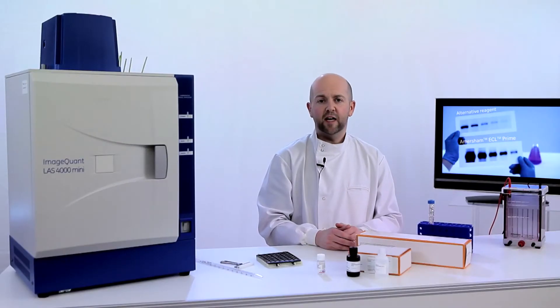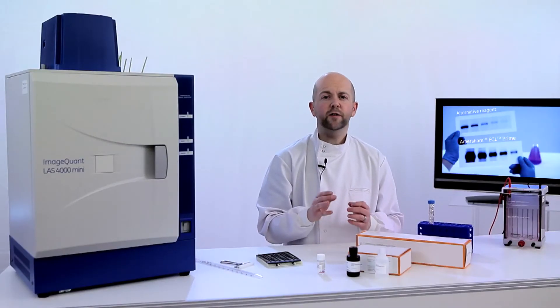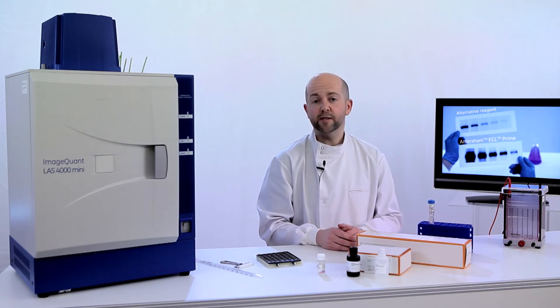There are three areas for you to consider before you start. It is important that the sample is of good quality and that the gel is loaded optimally. Select the electrophoresis and transfer conditions depending on protein size and characteristics.